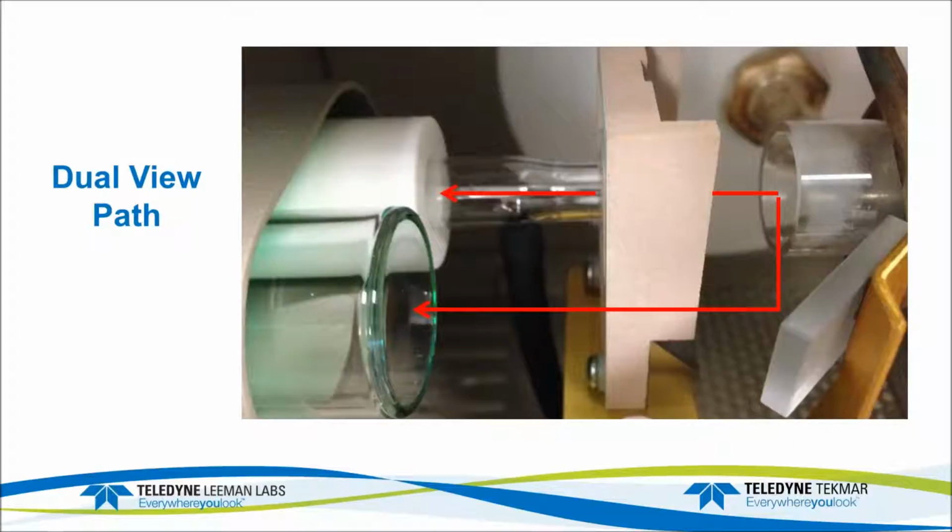This was a dual view instrument, so we have the ability to look at both axial and radial views. For this particular analysis for the hops with the trace metals, everything was done in the axial view. Concentrations for the trace metals were somewhat low. If we wanted to do some different elements like calcium and magnesium, which can be present at very high concentrations, we would have done those on the radial view.